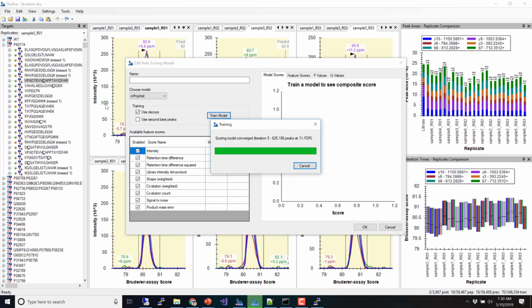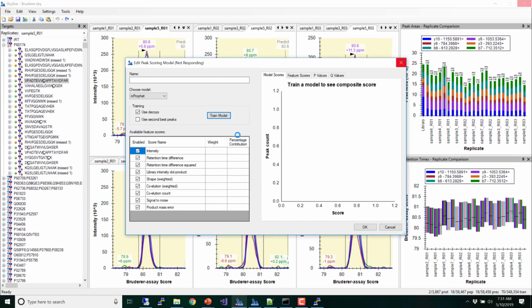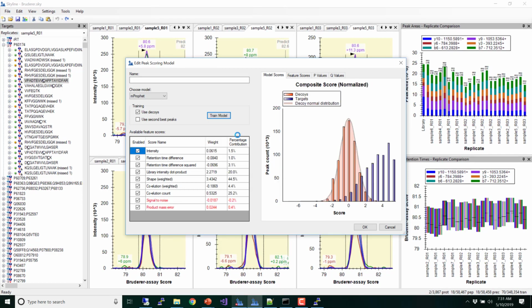So yeah, I'm really pushing the amount of memory that I have on this. That's one of the key factors with this big a data set. I've got a laptop with about 8 gig of memory. Anybody who has 4 gig of memory on their laptop may really be struggling. Is anybody still working on the model? Yeah, still working on the model. Okay. If you don't have at least 8 gigabytes of memory, it's not going to work.